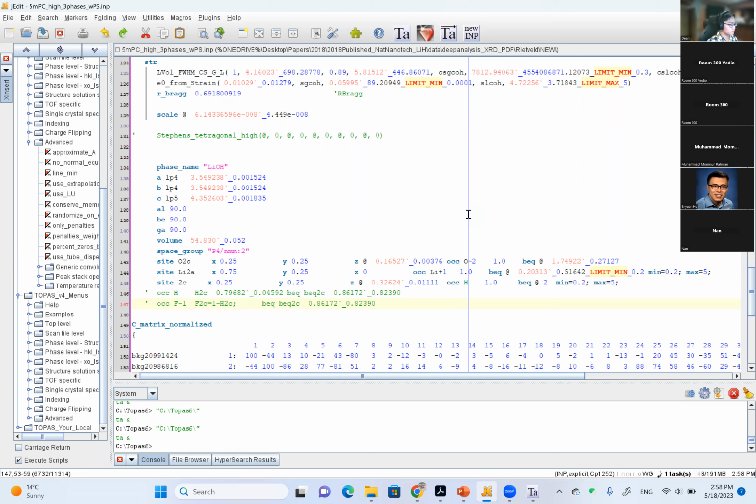In fact, the interesting thing is that in the very beginning, people imagined this to solve the structure. Why is that? Because people need to get accurate intensity information from each peak. For example, I can index this phase, so I know the hkl, but I need the accurate intensity from each peak. How do I do that?